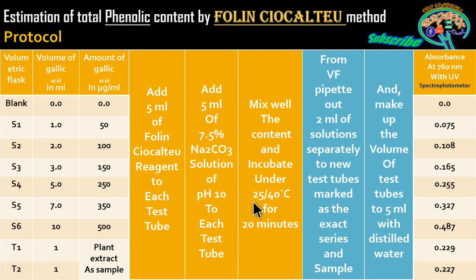The incubation is at 25 degrees centigrade or 40 degrees centigrade. In some papers and lab manuals 40 degrees centigrade is mentioned. So approximately you can use any temperature depending upon your requirement. Here we have used 25 degrees centigrade, but for the sake of knowledge we have mentioned 25 or 40 degrees centigrade. It has to be for 20 minutes.